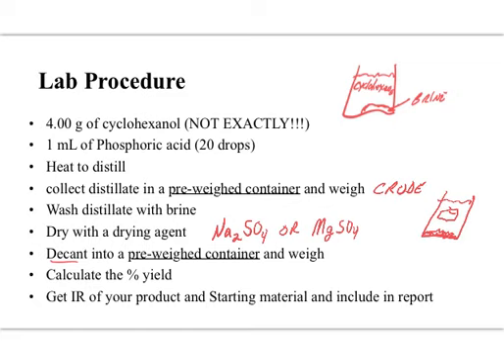If we know the mass, this will be our purified material. And we can compare how much we lost from the crude material to the purified material. From this, we're going to calculate a percent yield. That percent yield is based on how much you start with. That's why the number that you actually record is the important part.